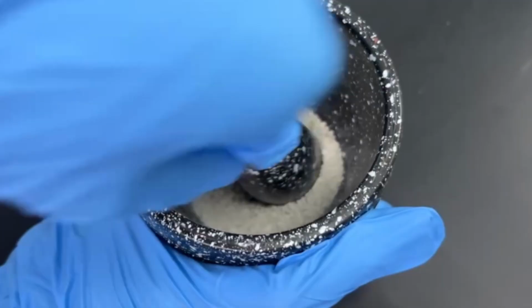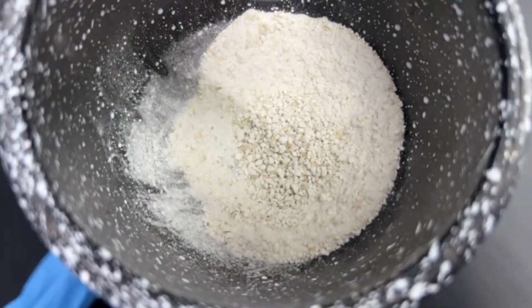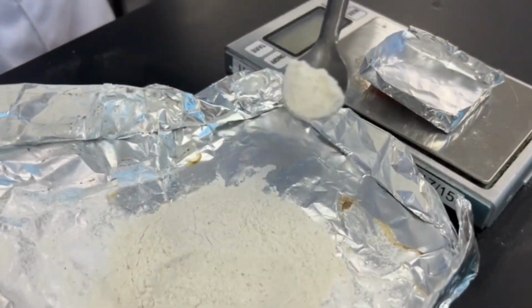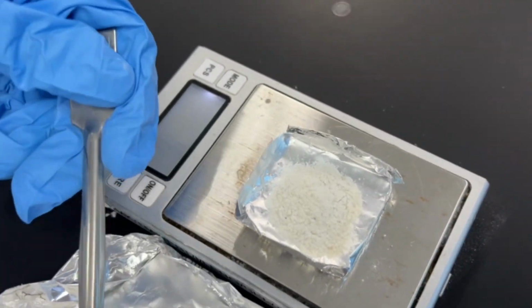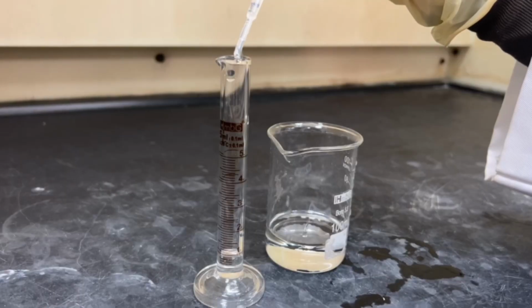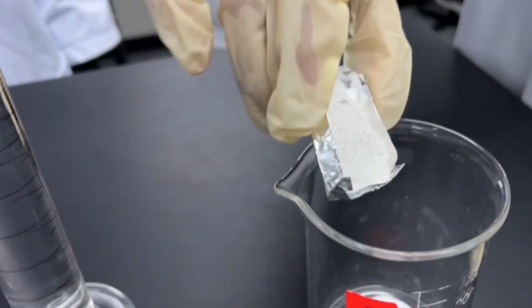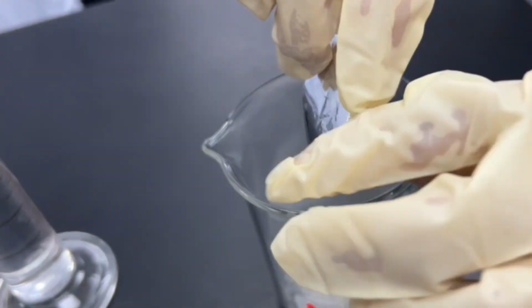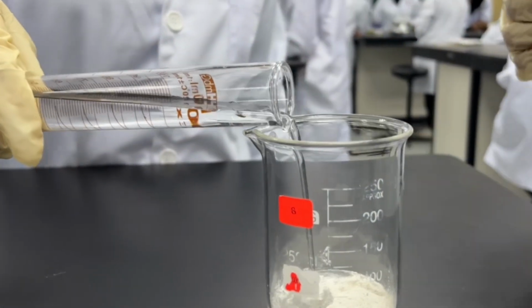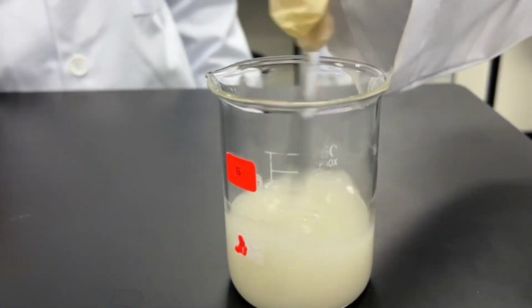From it, the potato starch obtained was ground using a mortar and pestle to become an even powder. Then, weigh it on aluminium foil using a digital balance to obtain 5 grams. Prepare 100 ml of distilled water and 15 ml of glycerol. Then we may start. To begin with, the starch is added to the beaker, followed by 100 ml of distilled water, and then stir it with a glass rod.